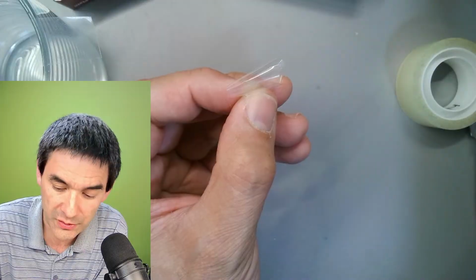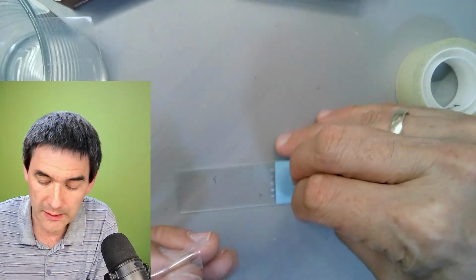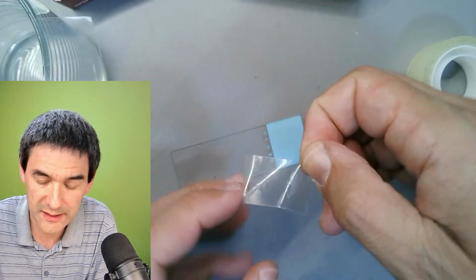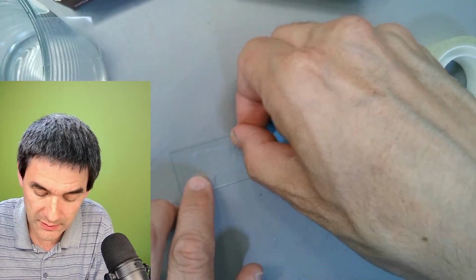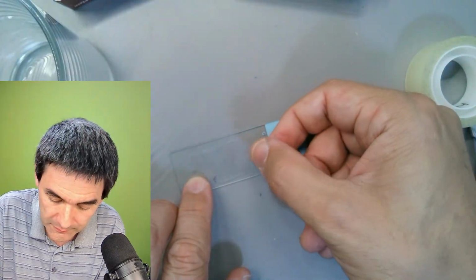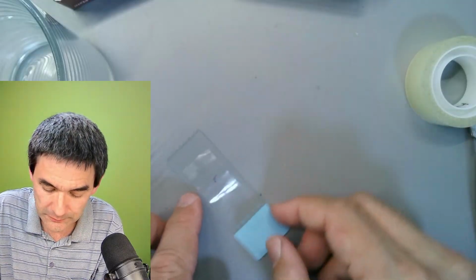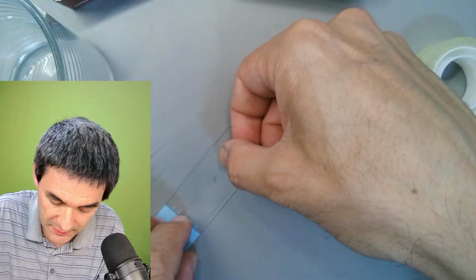What you do now is you take a microscope slide, sticky side upwards. You're now using those two smaller pieces that you prepared, and you stretch the tape across the slide.